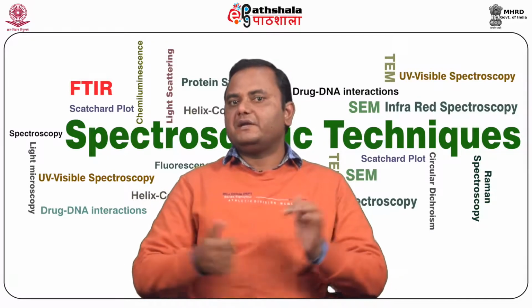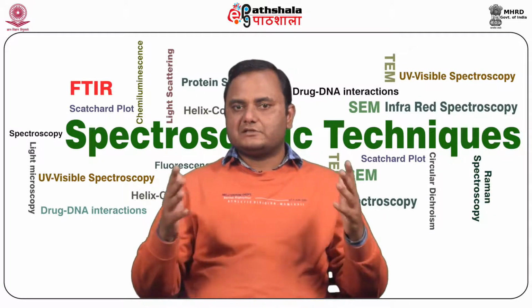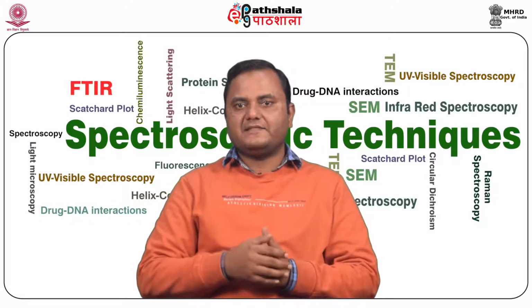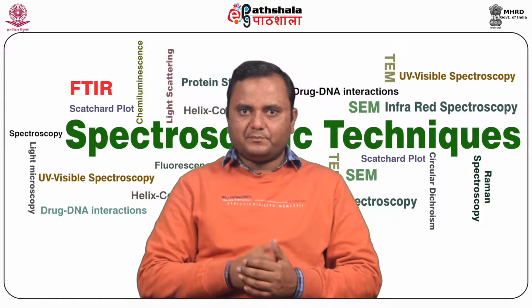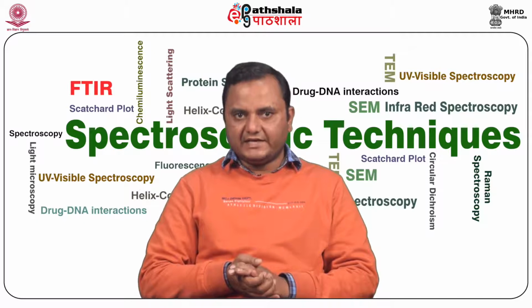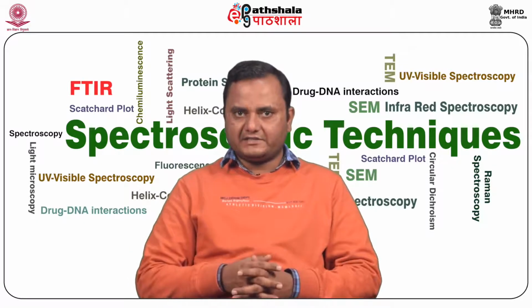Now we compare the CD with the ORD. CD plots are Gaussian rather than S-shaped as for the ORD, and the positive or negative deflection depends on the sign of delta epsilon or theta and corresponds to the sign of the Cotton effect.